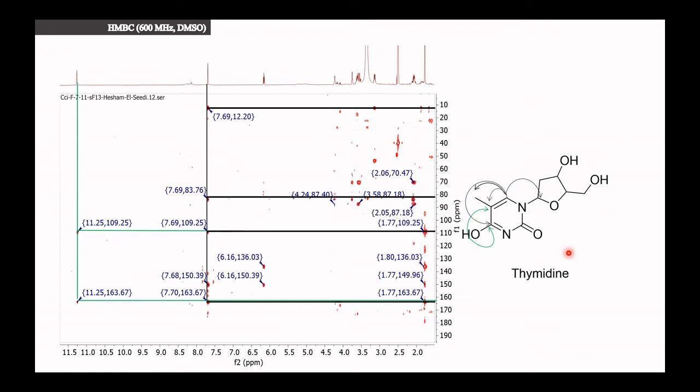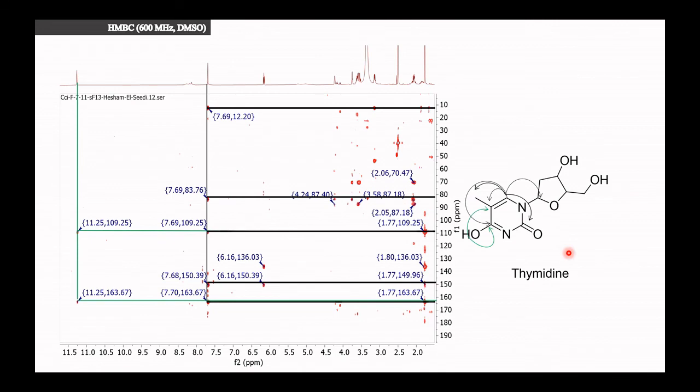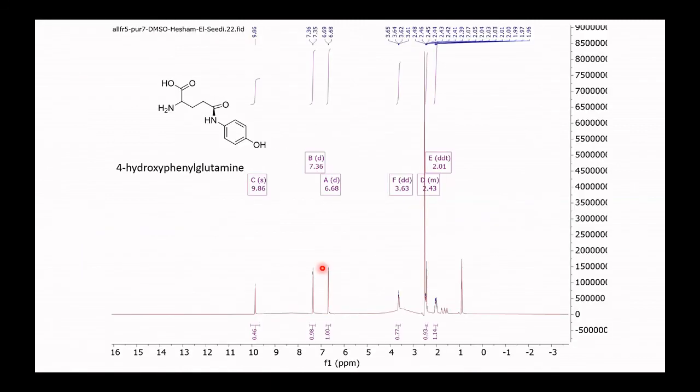I will take another example, which is a correlation. So you can practice by yourself the rest of the peaks here. Because you have the assignment from the proton, then you can go down and do the assignment of all the peaks in the same way as before.